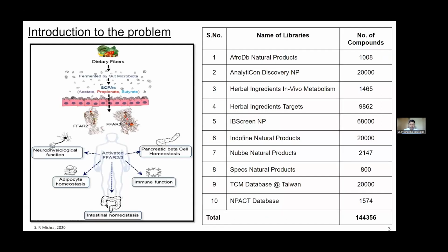Usually, this is just one small example which I thought of using to demonstrate how the tool or method that we developed becomes an important aspect.